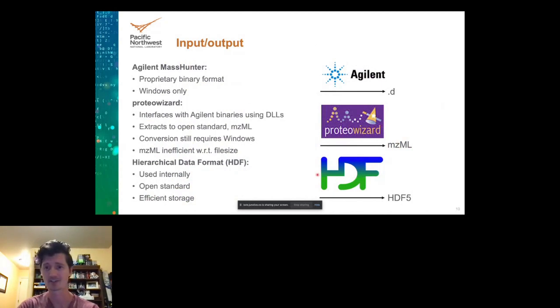It also takes quite a bit to read in a 3D mzML, with the LC, IMS, and MS dimensions simultaneously. In fact, it can take just as long to parse an mzML as it can to process the entire file, which is pretty crazy.